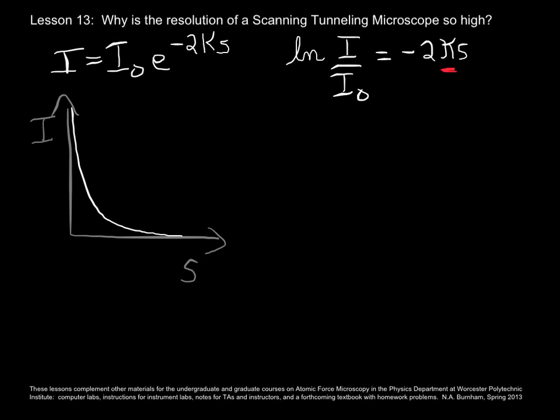So it has to do with the mass of the electron, the metals that you have chosen for your tip and sample, for semiconductors, and the condition of their surfaces. A typical value might be 12 inverse nanometers, and that's of course a rather strange sounding unit, but when you're talking about the arguments of exponents, the overall dimensionality of the argument has to be neutral, and because we would measure S in nanometers, then kappa has to be in inverse nanometers.